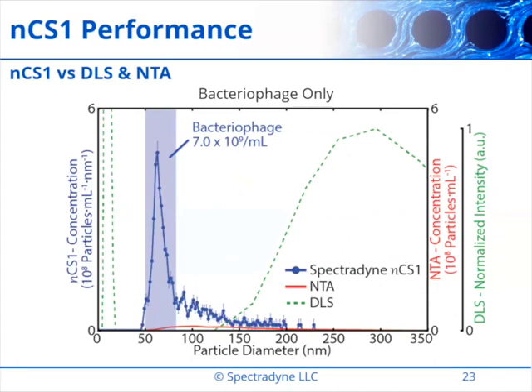In green, there is a DLS peak, but DLS will always try to give you a peak. In this case, the polydispersity index was quite high. I believe it was over 0.7. So a knowledgeable user of DLS would not trust that data. And then the NTA plot kind of collapses. These bacteriophage particles are just too transparent to be picked up at the small 60 nanometer size.